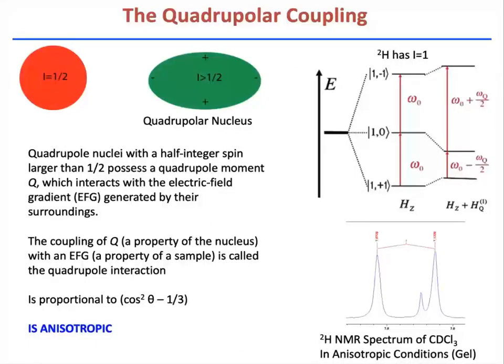So to be realistic, the goal here is, okay, you want to collect RDCs. I'm going to show you the practical aspect, and the practical question is: what do you have available and how can we do it?